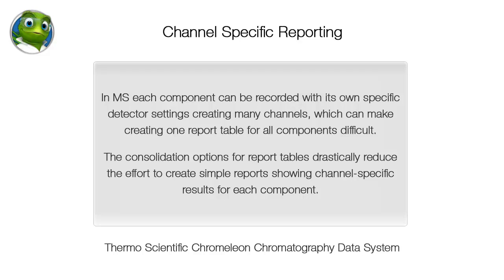In MS, each component can be recorded with its own specific detector settings, creating many channels which can make creating one report table for all components difficult.